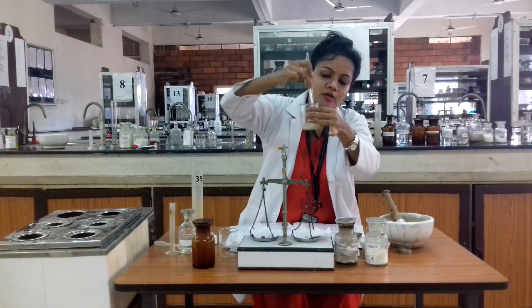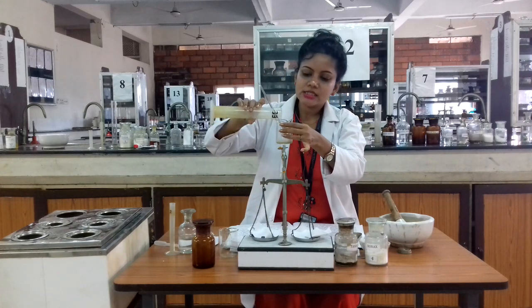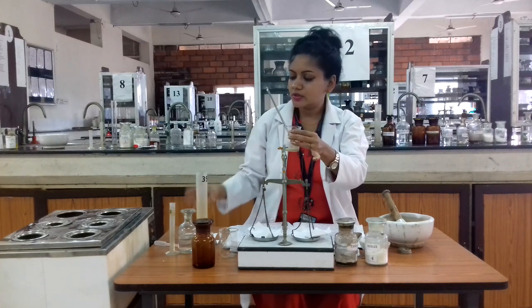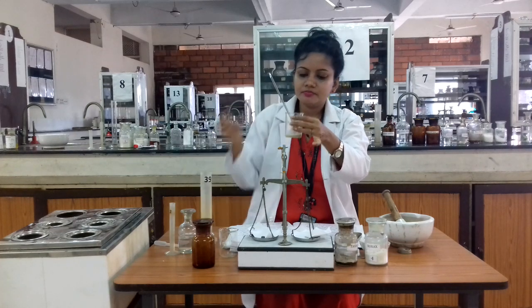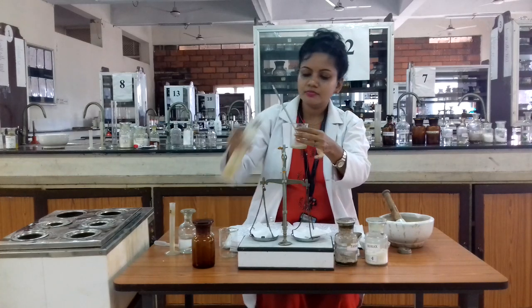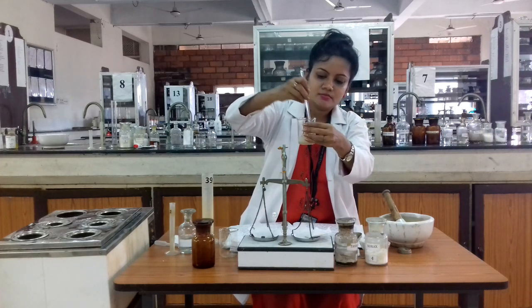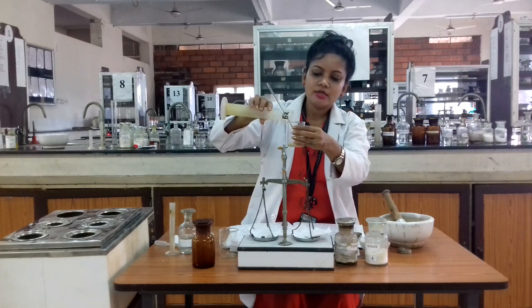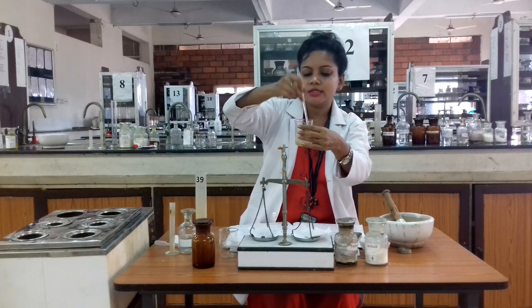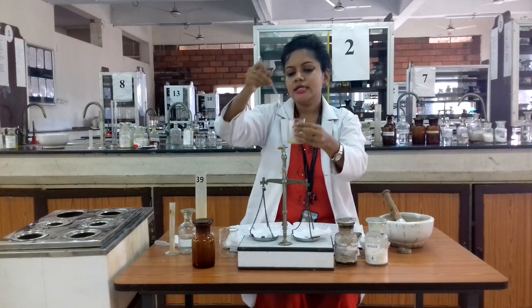Continued stirring is most important to dissolve all the tannic acid and borax powder. Then we add some more glycerin. After adding all the glycerin, we place this beaker in a water bath, usually maintaining the temperature at 30 to 40 degrees Celsius. That is the normal water bath temperature. We add 20 ml of glycerin and then place it in the water bath.